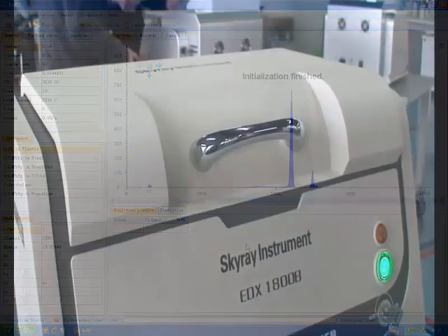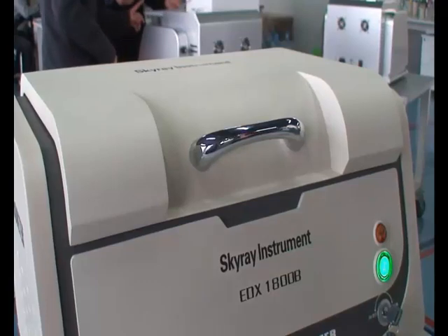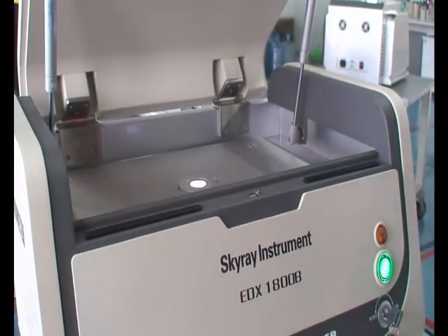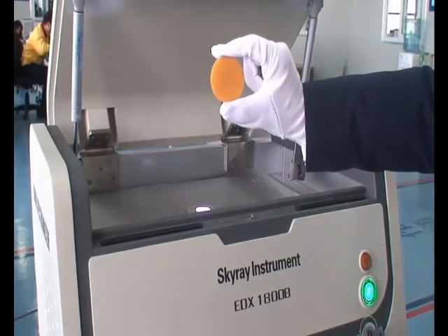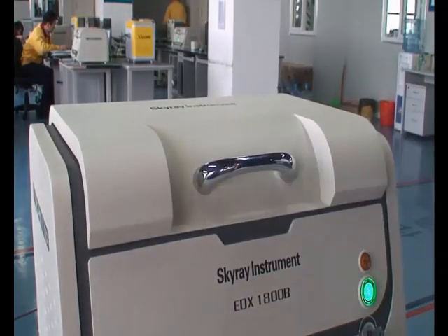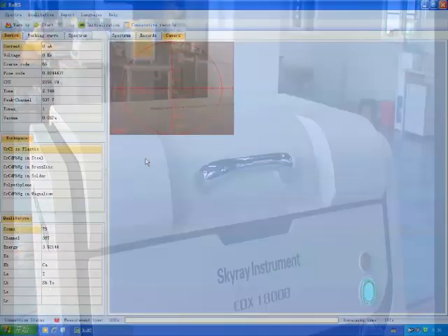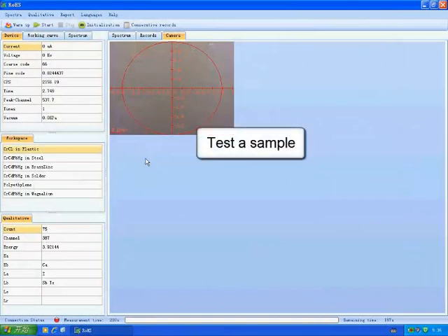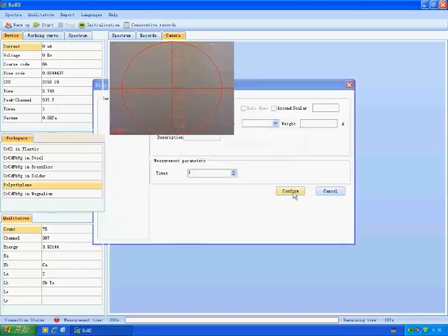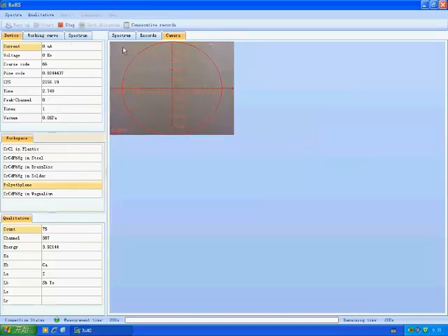Choose an unknown sample. Click Start, enter some information on the sample, and click Confirm to start measurement. Now it indicates the measurement is completed.